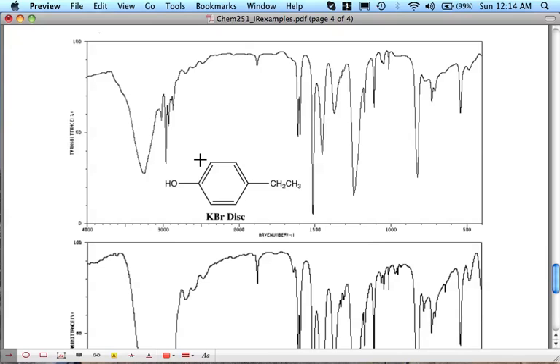Well, let's do a little quick analysis just to get up our practice. You guys might know enough to do this, so why don't you pause the video and try to assign all these, and then you can come and see what I say. Okay, so I assume you're back and you've analyzed this. Were you able to find the OH peak? I'll go ahead and circle it. Hopefully you did.